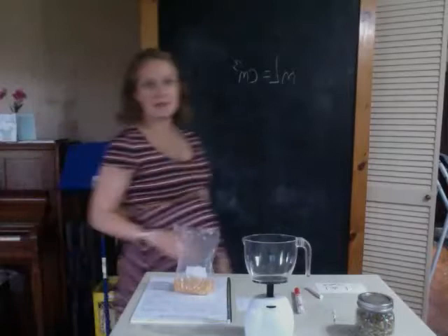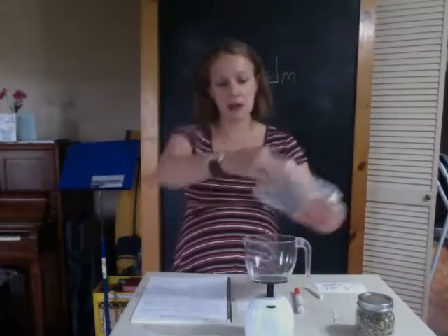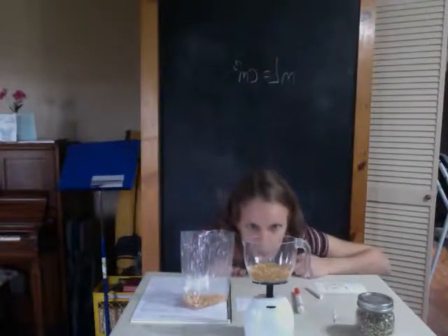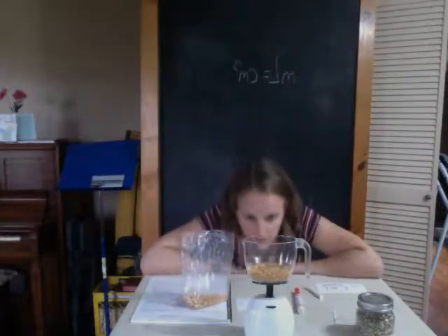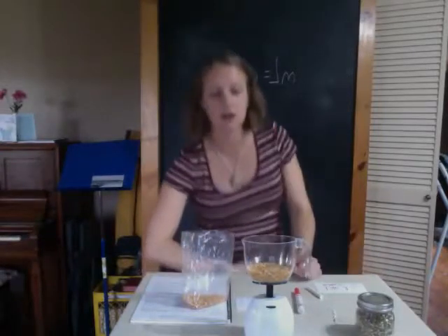Okay, so I'm going to take my measurements and then we'll get to the calculations. So we have yellow split peas. I'm going to measure 3 groups of samples from this bag. So the first, I'll fill it to about 100 milliliters. And again, I get down to eye level to make sure I have a good, accurate measurement. And then I'm going to take my reading. So it looks like it's above 0. And it's 1, 2, 3 small lines above 0. So that means I have about 60 grams. And that's as accurate as I can be.